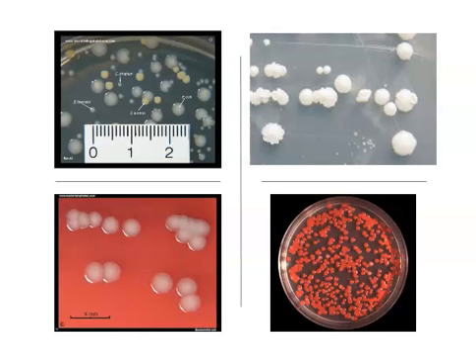On this slide, you're looking at the surface of 4 different agar plates, and there are all kinds of colonies growing on these plates. There's a couple things to note here. This plate up here that has this short stretch of ruler on it has several different visible types of colonies growing on it.